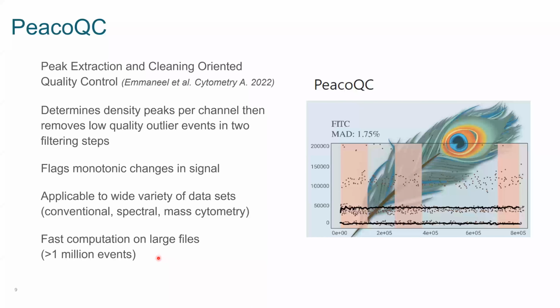Try to approach 32 gigs, maybe even 64 gigs if you can. But that doesn't mean these tools won't run on less. You'll just feel the time a little more than you would if you had a device with more RAM. So more RAM will definitely give you a faster experience. But again, that's not to say you couldn't run these tools on more typical benchtop devices.